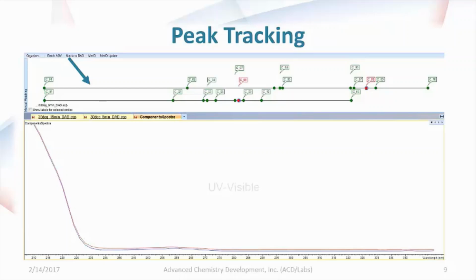So as the expert, I can then go through and review the matching results that the software has provided, and then determine whether or not the software has done an adequate job of matching the data.